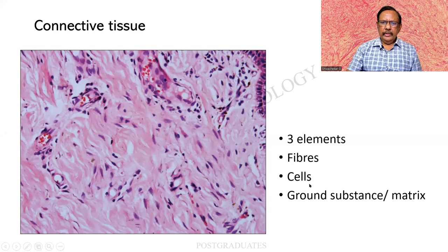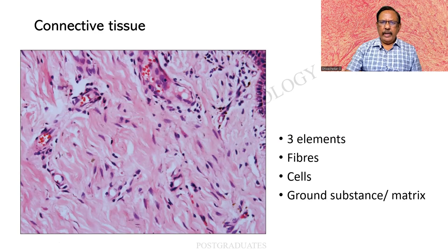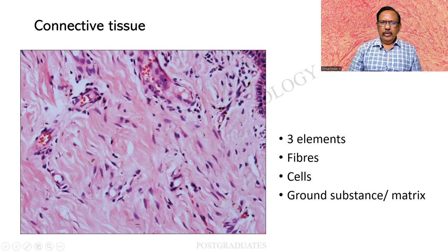There are basically three elements. One will be the fibre, two the cells, and three the ground substance or matrix. In this example, I am able to see delicate spindle-shaped cells which are nothing but the fibroblasts. Also, there are some broad ribbon-like pale structures which are never-ending. If you look very carefully, there is a supporting material for this structure — that is the ground substance or the matrix. So we have seen the fibroblast, the collagen fibres, and the ground substance or matrix.